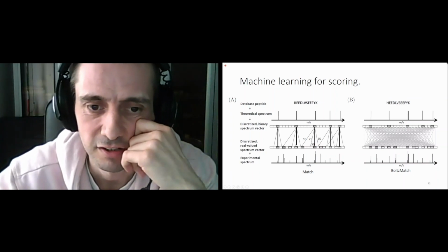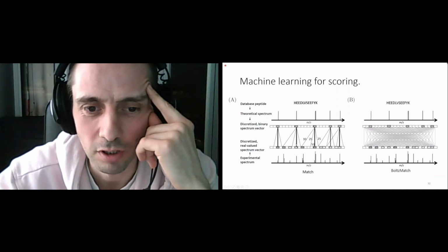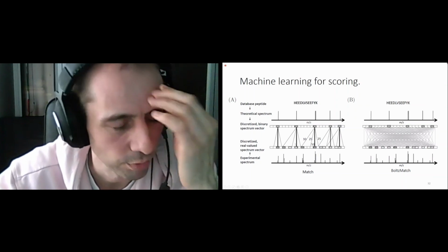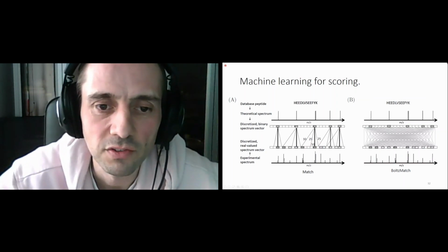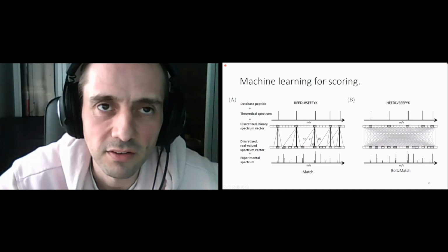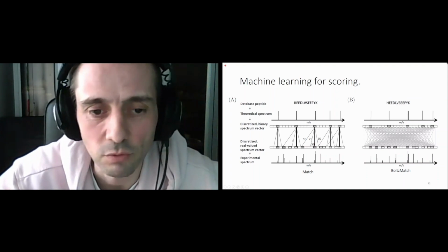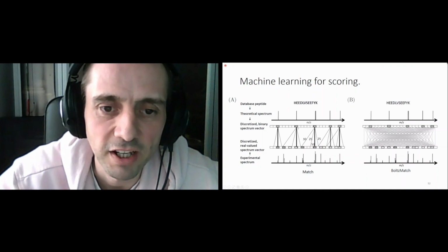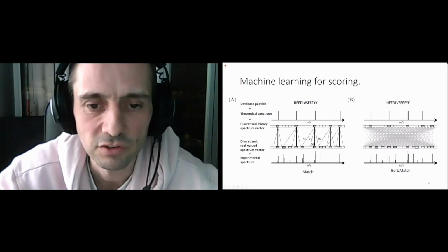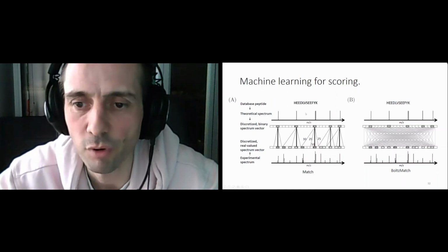Here the difference between the major primary fragmentation peak and the flanking peaks is usually the mass of one proton, and they might correspond to isotopic errors, so some isotopes. And then it also can consider, maybe, a carbon monoxide loss or ammonia loss or water loss. And this way, this match is weighted by 10. Okay, so this is the X-score scoring function. It has this more advanced scoring to increase the discriminative power.